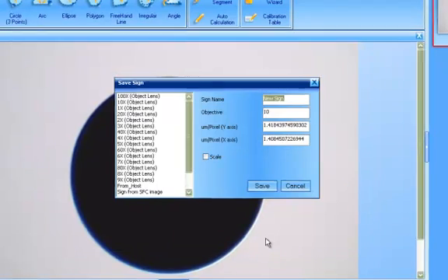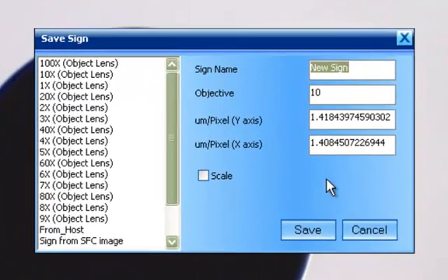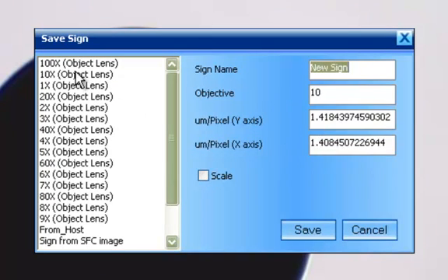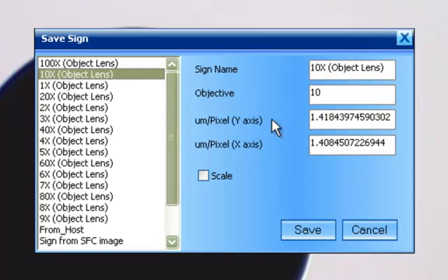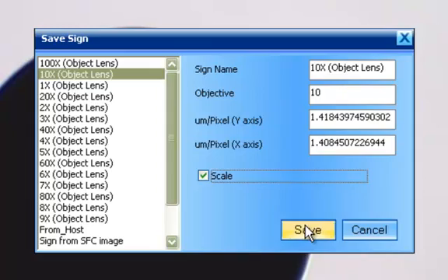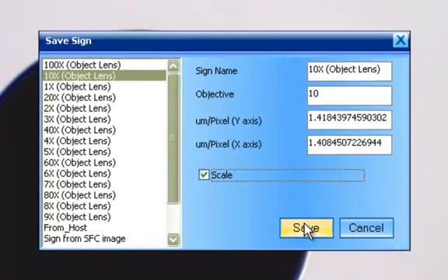Click on the calibration button and the computer will locate the dark circle. Now, you can give it another name or you can just click on the 10x objective lens name. Click on scale and click on save.